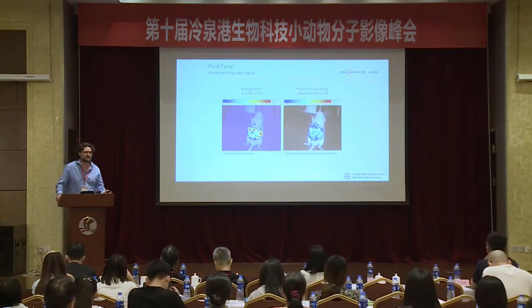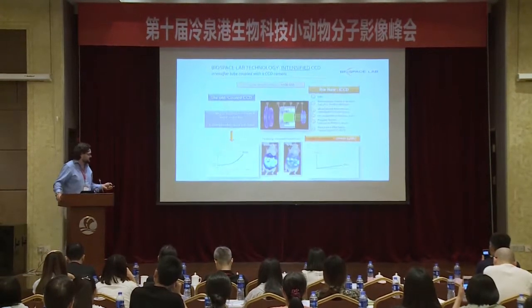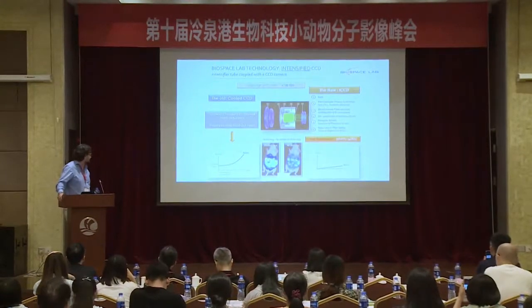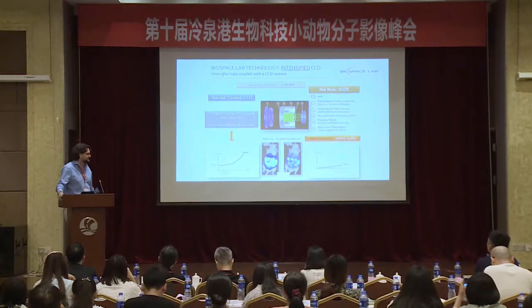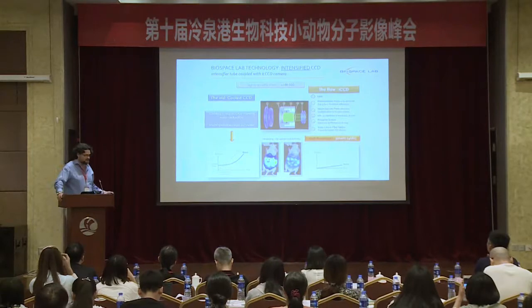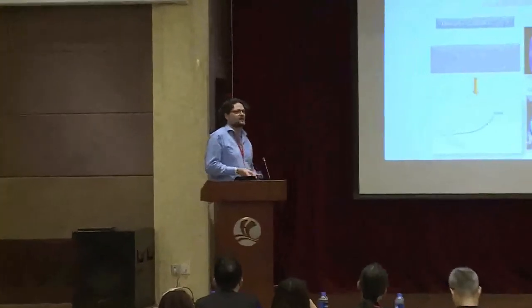So if you want to talk about optical imaging, you want to talk about low light genetic reporters or optical reporters. And the problem with low light reporters is how you get the signal above the noise of the CCD. So the traditional approach is to use cool CCDs, and the reason why you cool your CCDs is to reduce the thermal noise, the dark noise of the CCD, in order to get the signal coming above the noise of the CCD. And the other problem with cool CCDs is that you have to wait a long time to have enough integration of the signal to get above the dark noise.